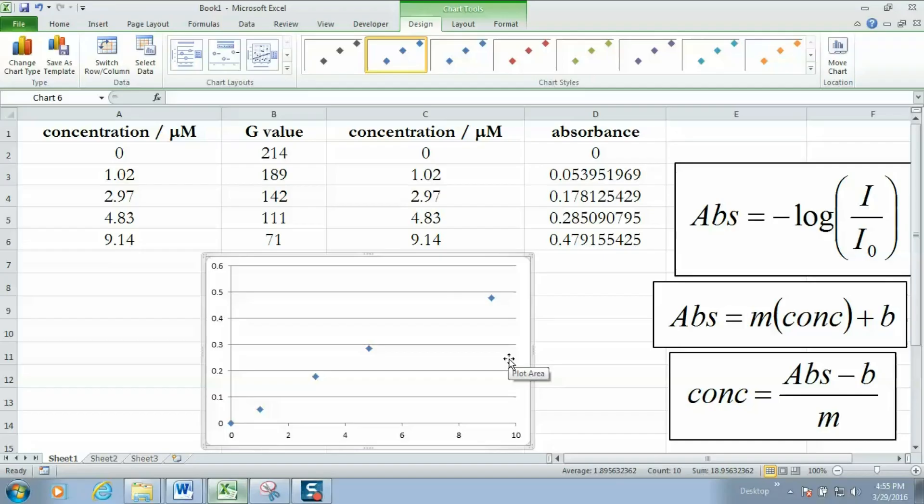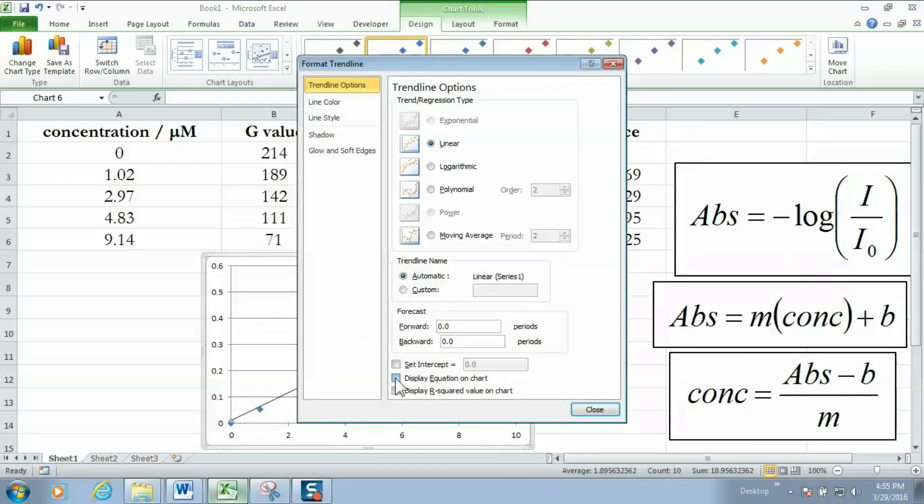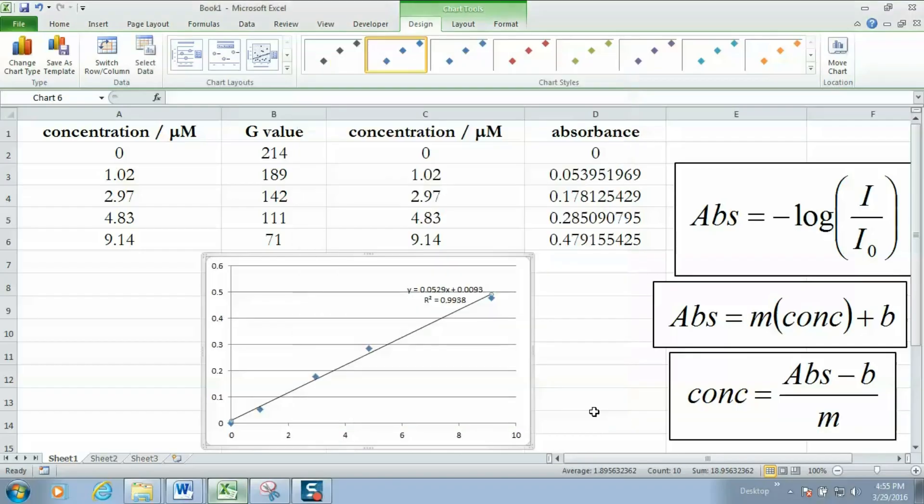I want to know what the equation for this line is. So I'm going to right click on any data point. I'm going to add a trendline. Display the equation on the chart and also the r squared value. The closer that is to one the more linear the fit is. And if I look at my equation for the line I see I have an r squared value of 0.9938 which isn't too bad.